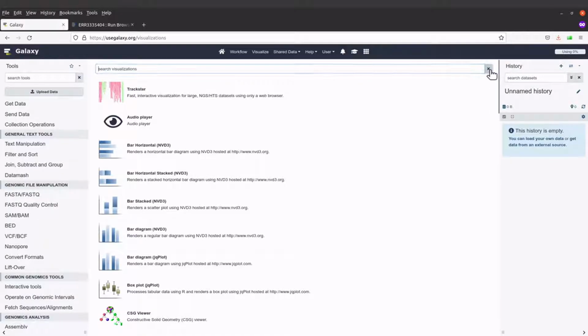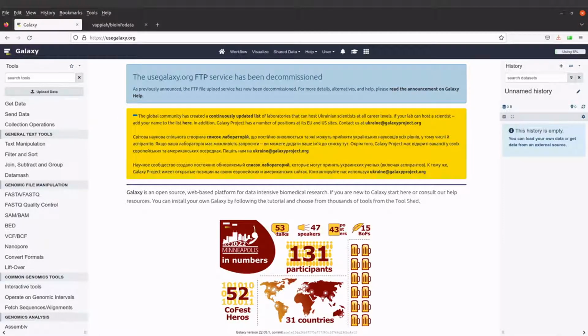Now, let's test Galaxy. We are going to run an example analysis. So let's go back to the home page now. Okay, we are now ready to test Galaxy. So what we are going to do is to perform genome annotation using the tool Prokka. And so we need to first name this activity that we are going to do. Okay, so that is where the history comes in.